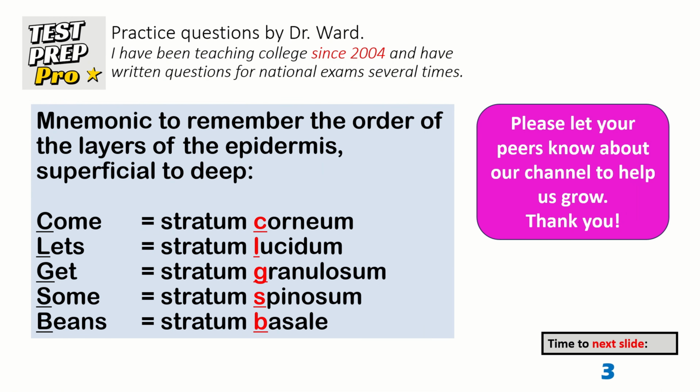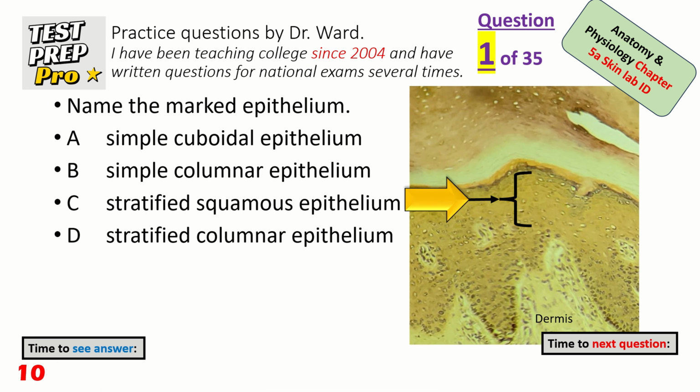This is a mnemonic to help you learn the stratum of the skin, top to bottom. Name the marked epithelium. The epithelium of the skin, what do you call it? Stratified squamous epithelium.